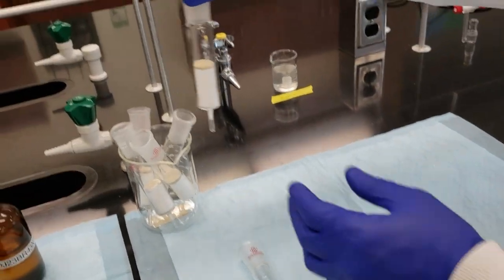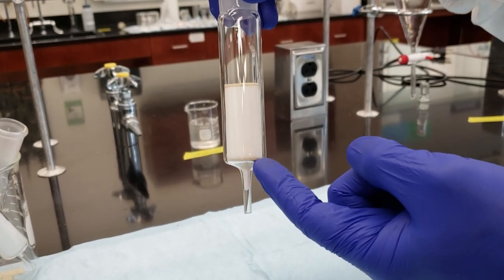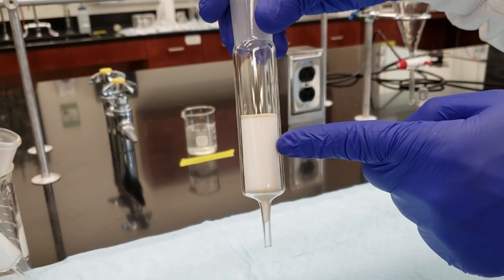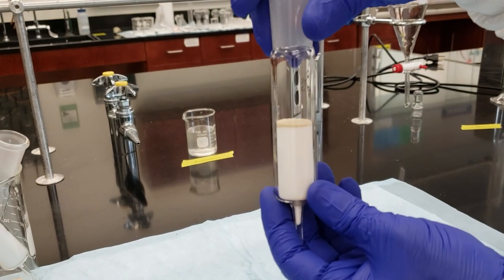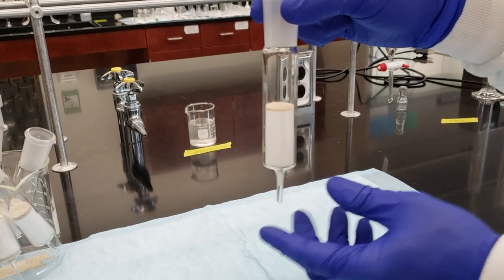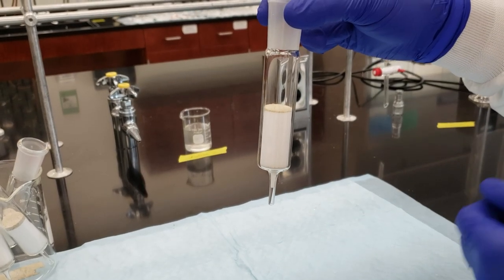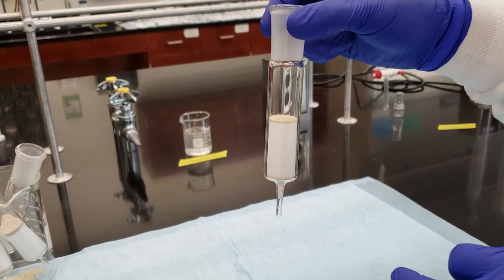We'll take a look at this column here. So we have our cotton plug. We've got our layer of sand on the bottom. We've got our silica gel layer here in the center. This is what's actually going to do the separating for us during our flash chromatography. And then we have our sand layer on top. So we'll be pipetting our solution in very slowly into the top of our flash chromatography setup and allowing it to flow through the silica gel that will separate our product from any remaining byproducts or impurities, so that what we collect at the bottom of this column should just be methylene chloride, diethyl ether, and our product.